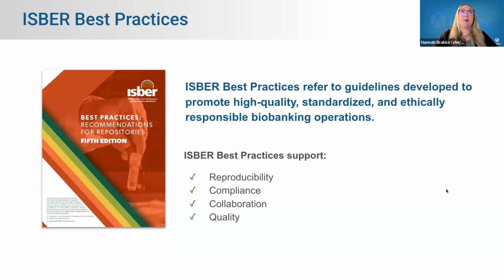So, what are ISBER best practices? They're a comprehensive set of guidelines that were developed to support high quality, standardized, and ethically responsible biobanking operations. They're designed to help biobanks of all types achieve excellence in how they collect, manage, and share these biospecimens.